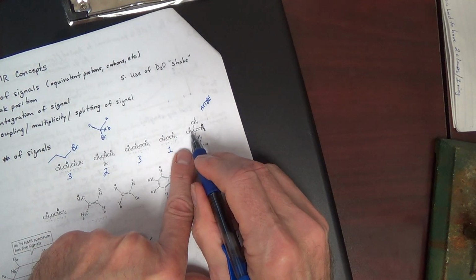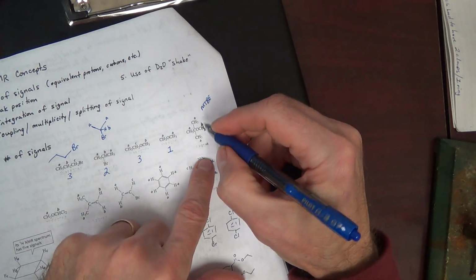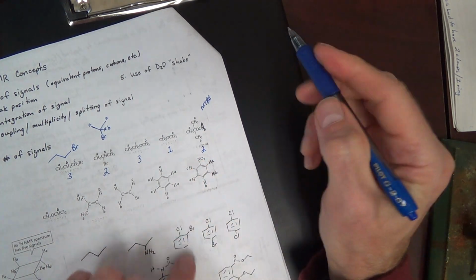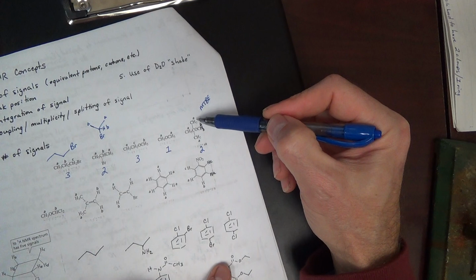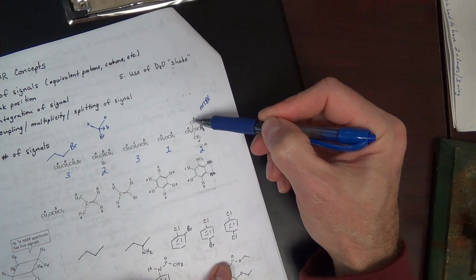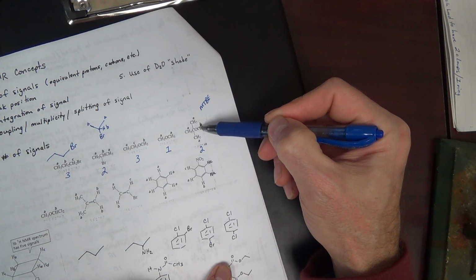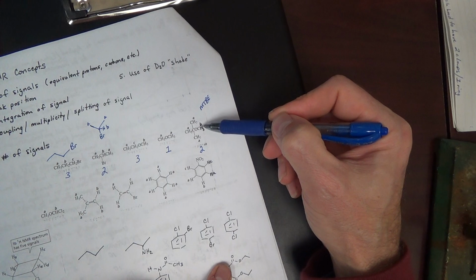Problem is that's sort of backwards. The tert-butyl should come first. Tert-butyl methyl ether. Anyhow, how many signals here? Well, the answer is 2. We have these 3 methyl groups that are all the same. That's 1 signal. And then the CH3 bonded to the oxygen would be a second signal.